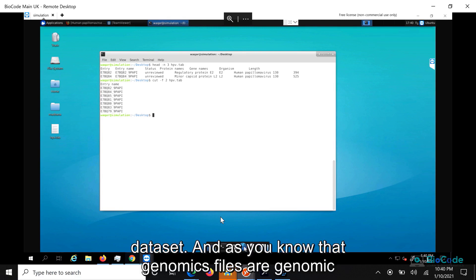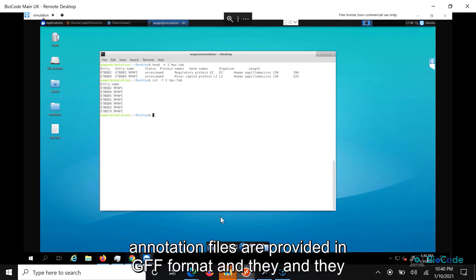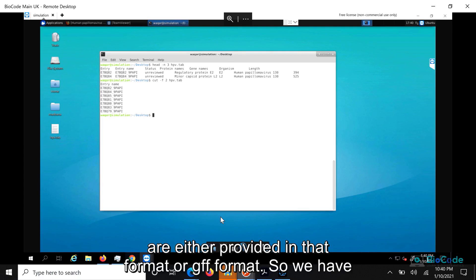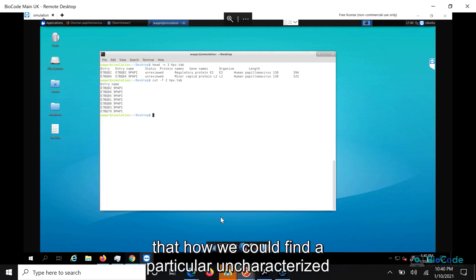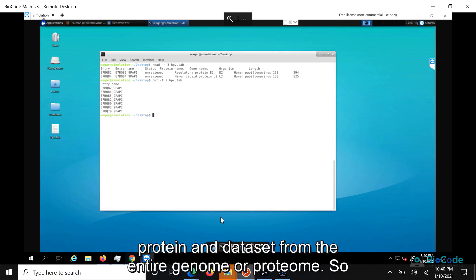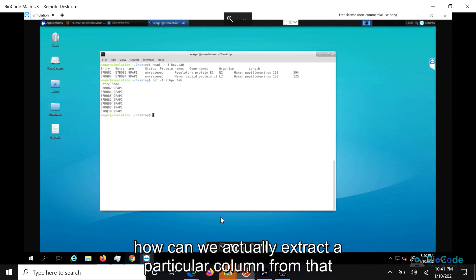As you know, genomic annotation files are provided in GFF format or in BED format. As we saw previously in the grep video, we could find a particular uncharacterized protein in the dataset from the entire genome. So how can we actually extract a particular column from that file?